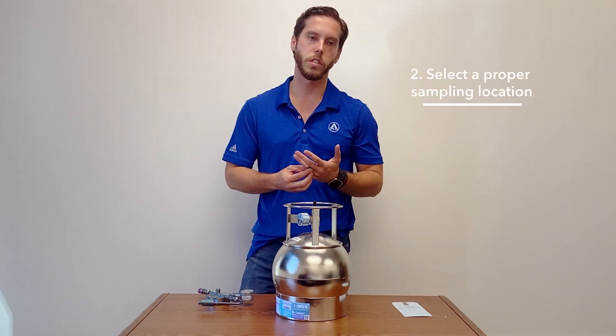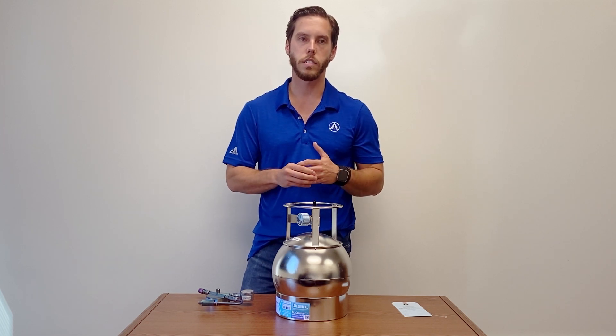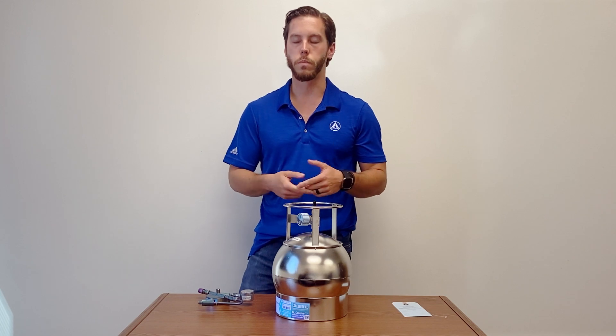You need to select a proper sampling location. Pretty much just avoid placing the canister near any HVAC or exhaust. Anything that can be seen from the street — you don't want to place it there just to avoid confusion from the public.